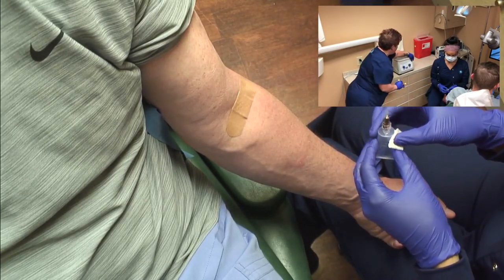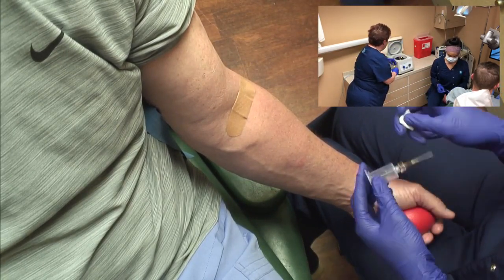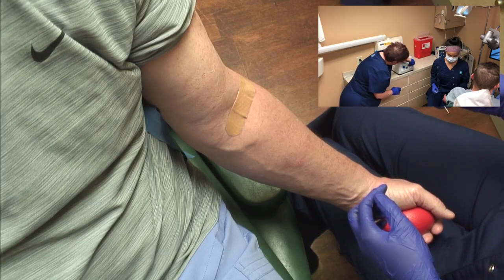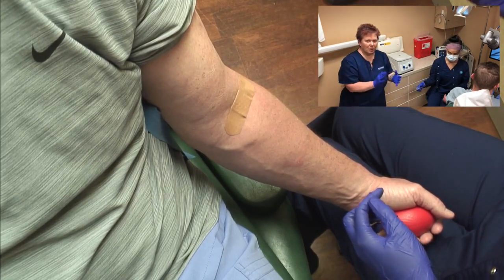And this is completely stopped. Now I can press this button. And we put these opposite each other. Press the lid down. Put this back to 15. Now we wait for our blood to spin.